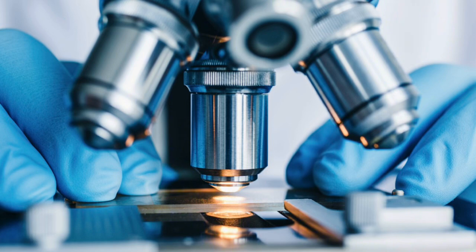Another important microscope is the stereo microscope, also known as a dissecting microscope. Unlike the compound microscope, it produces a three-dimensional image. This allows forensic scientists to see texture, depth, and small details. Stereo microscopes are especially useful for examining hair, fibers, paint chips, soil, and small tools.